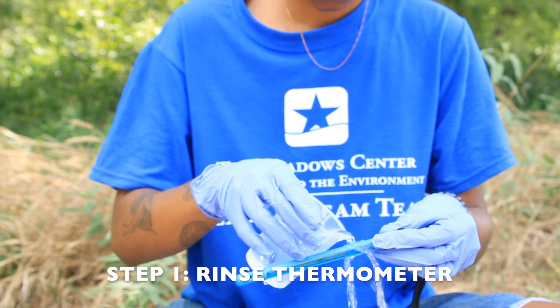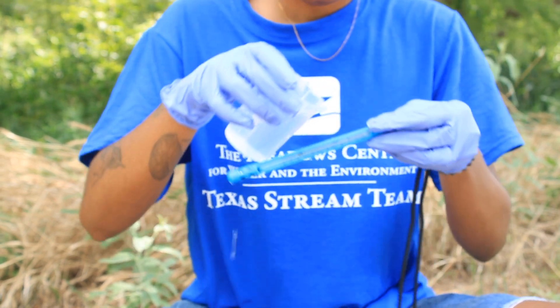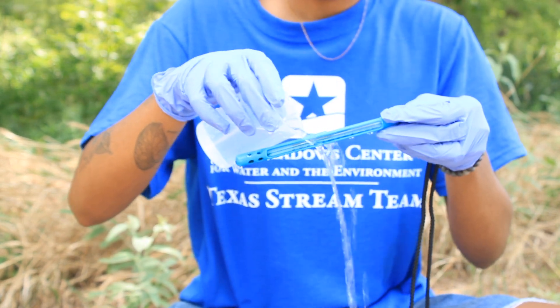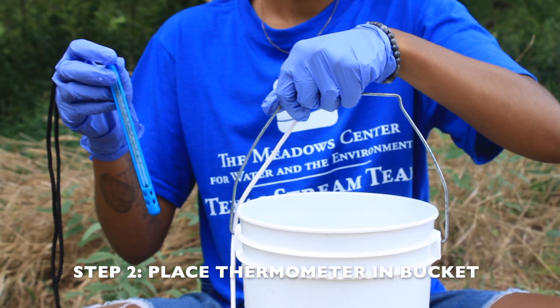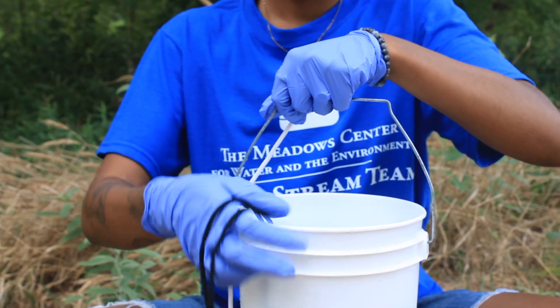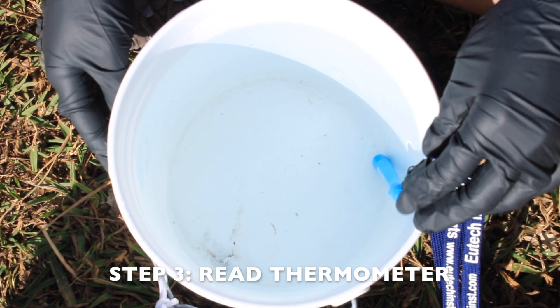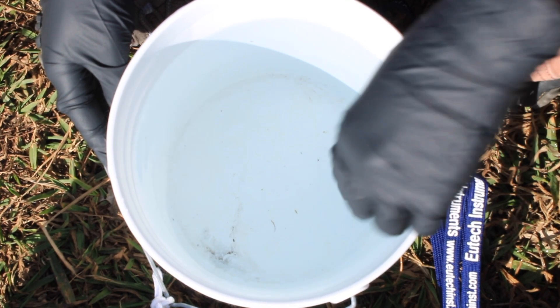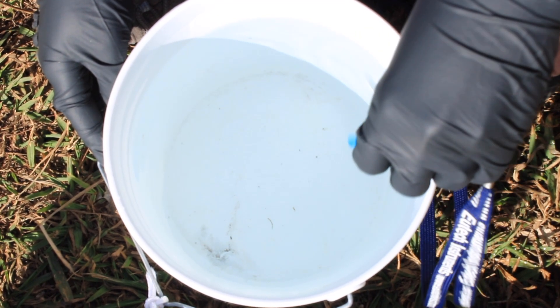For step one, rinse the thermometer twice with the sample water to avoid contaminating the sample bucket. If you are using a beaker to assist with rinsing, be sure to also rinse the beaker. For step two, place the thermometer in the sample bucket for one to one and a half minutes. For step three, read the thermometer while in water to the nearest 0.5 degrees Celsius.